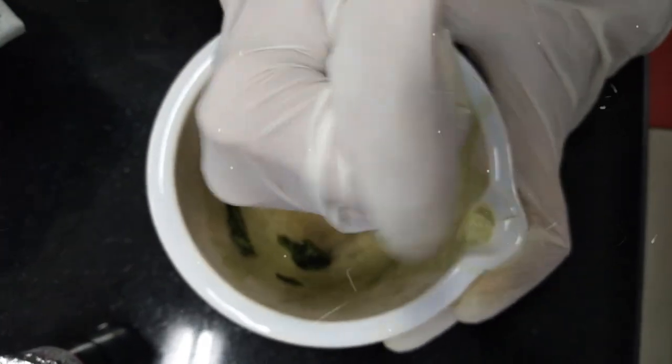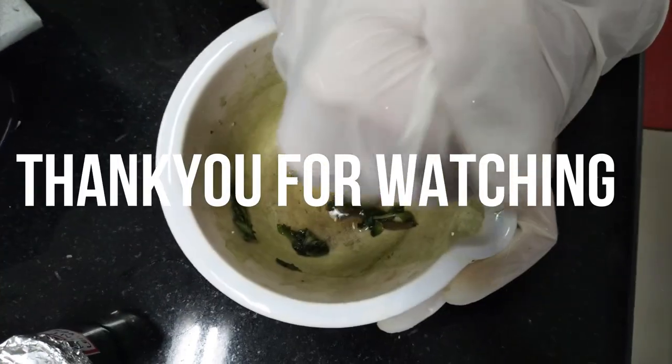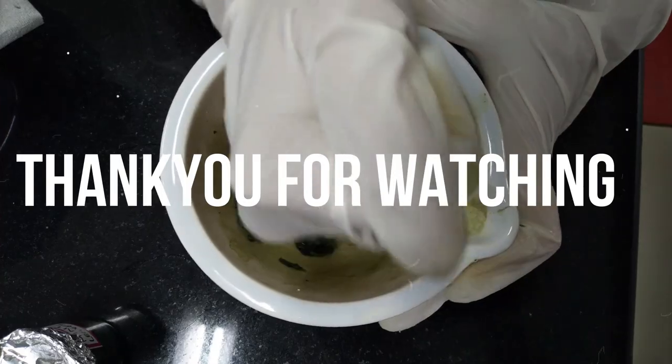Similarly, we can perform TLC for other phytoconstituents using suitable standards and solvent system.